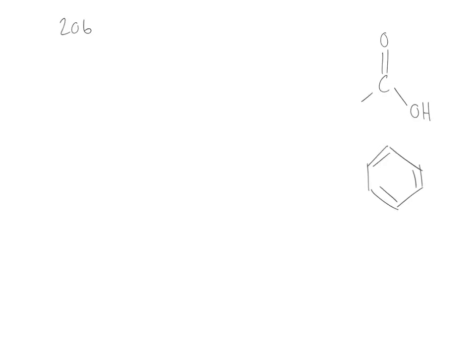We know from our IR and mass spec analysis of ibuprofen that we have the functional group carboxylic acid as well as the presence of a benzene ring in our structure. Next we have to determine the molecular formula of ibuprofen. To do that, we're going to start with the molar mass of 206 and then subtract the largest atoms we have present in our molecule. Since we have 2 oxygens present, we're going to subtract the combination of that molar mass, which is 32. So 206 minus 32 is 174.